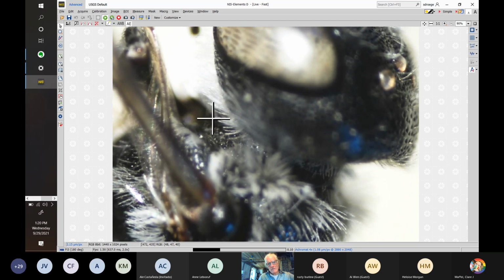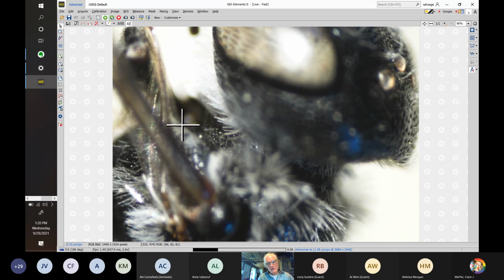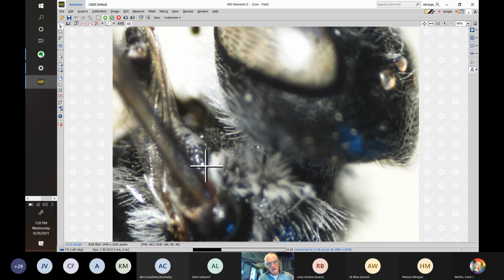So somewhat better. Never can tell what you guys are seeing here. Here's the two plates, or the two sides of the same plate. This is the lateral side. Here's the anterior. This is the sharp line, and it is pretty visible. This is as high power as I can get on there. But if you're imaginative, I believe you can see that there is a raised line. You certainly can see that there is a sharp transition between these two faces. Would not be there. Can you move the cursor out of the way so I can screenshot? Yeah. Great. Would not be there otherwise.